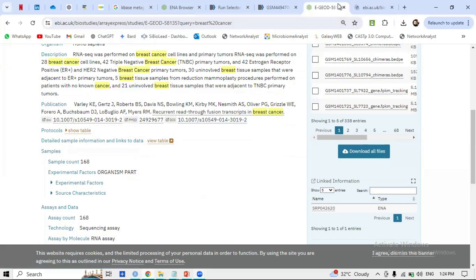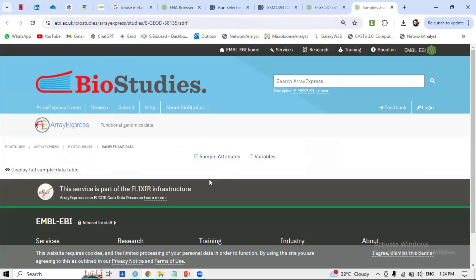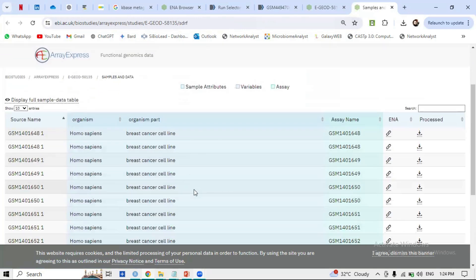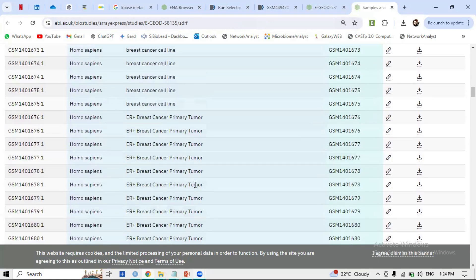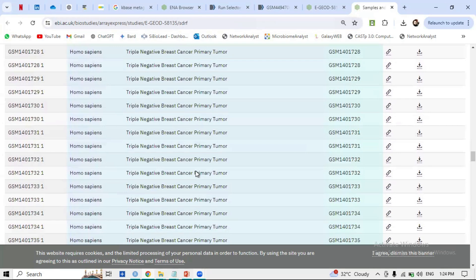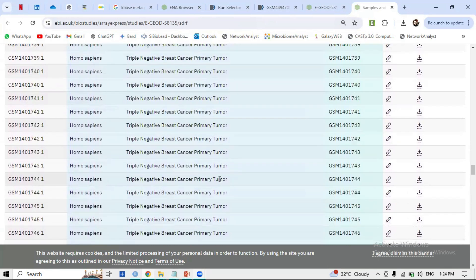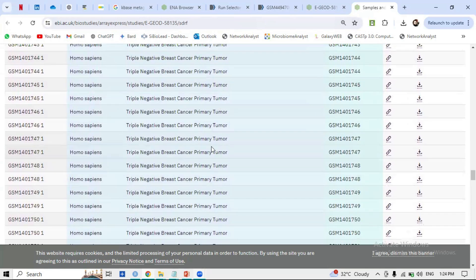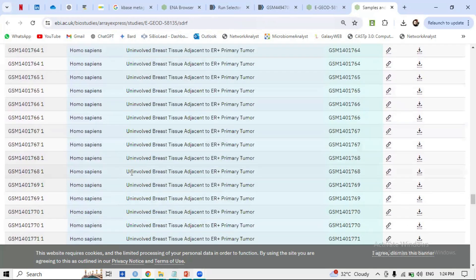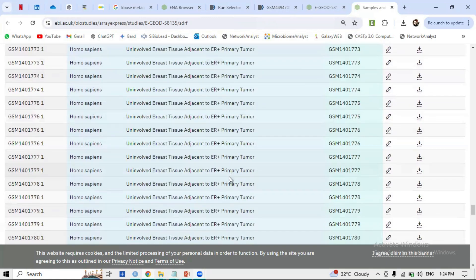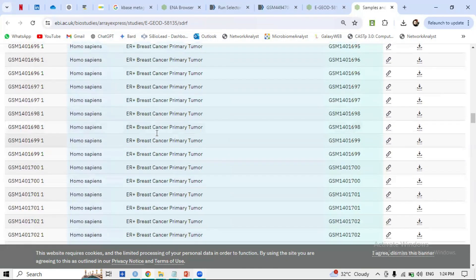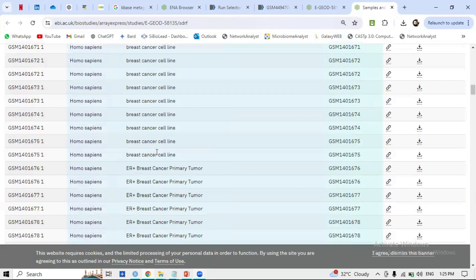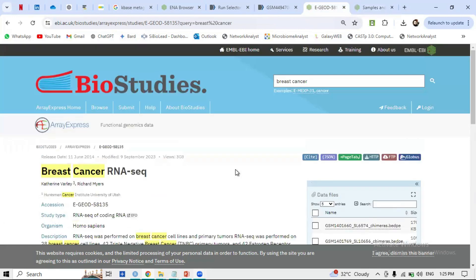Let's look at a study: 'RNA-seq performed in breast cancer cell lines, primary tumor.' Sample count is 168. Click 'View Table' to see the metadata. Loading the table, you can see all samples are related to human cell lines. Phenotypes include ER-positive breast cancer primary tumor, triple-negative cancer cell lines, and uninvolved breast — the healthy ones. About four to five phenotypes are present.